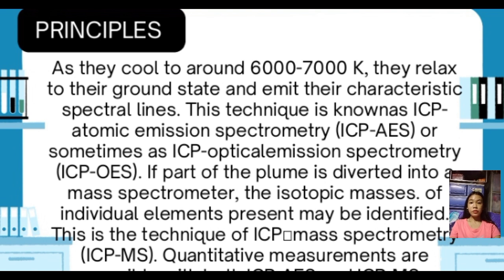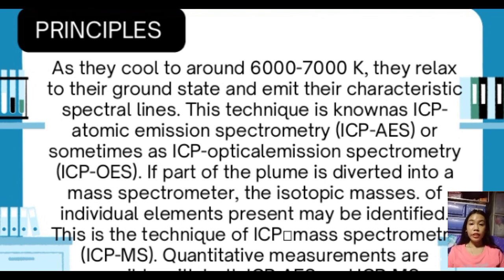This technique enables the determination of isotopic masses for individual elements present in the sample. ICP-MS provides high sensitivity and precision, making it particularly valuable for trace element analysis.